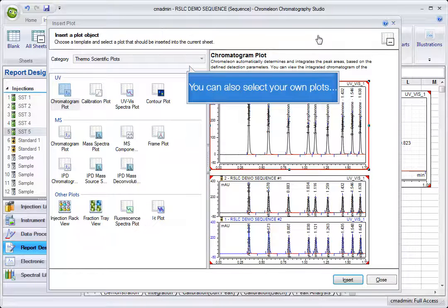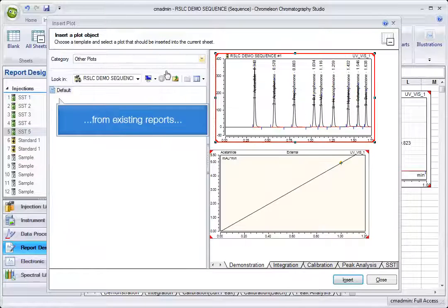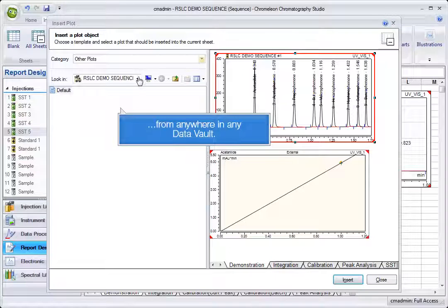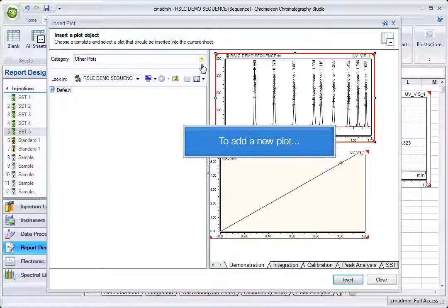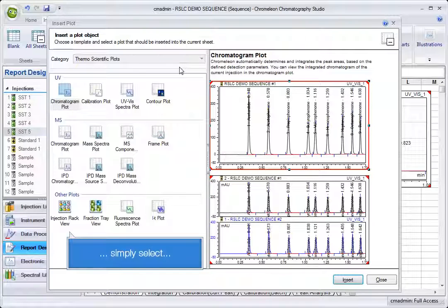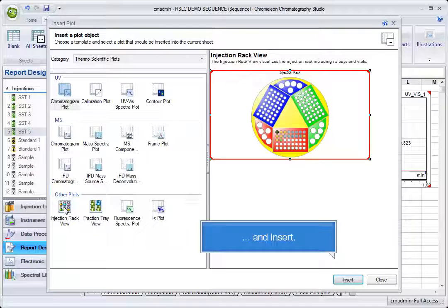You can also select your own plots from existing reports, or from anywhere in any data block, to add a new plot. Simply select and insert.